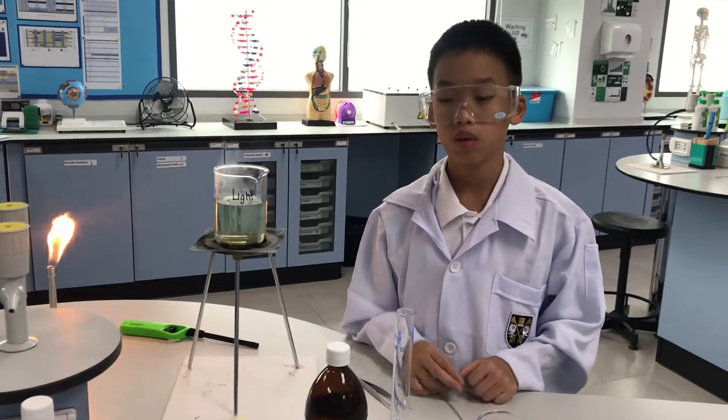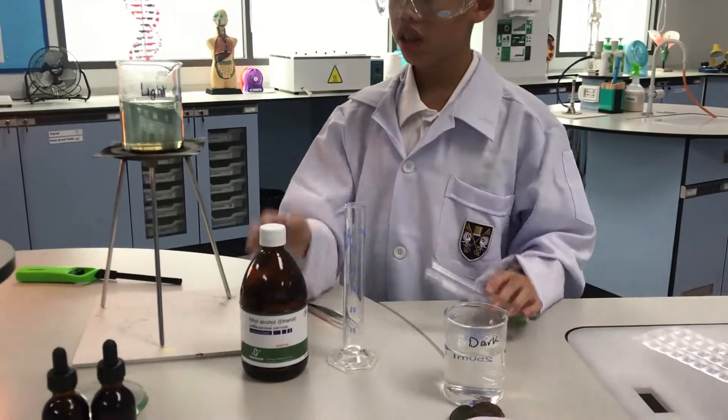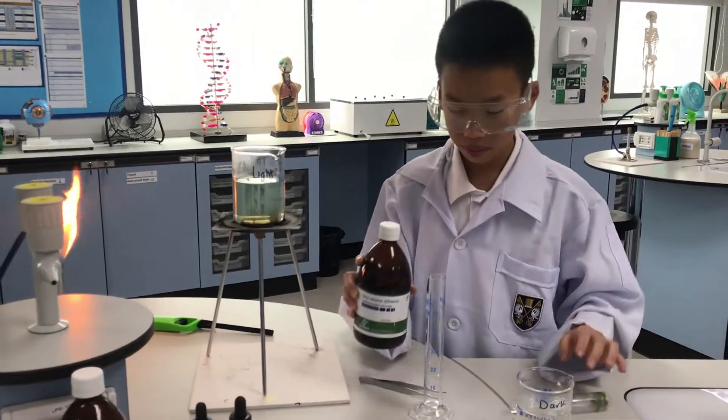We're now going to add the alcohol in to cover the leaf. You need to always make sure that the alcohol is away from the Bunsen burner.